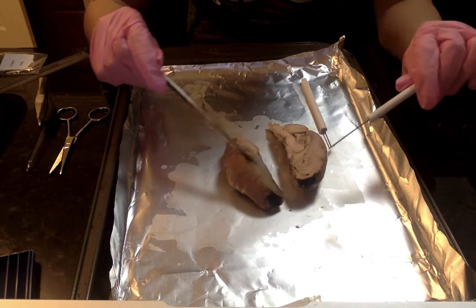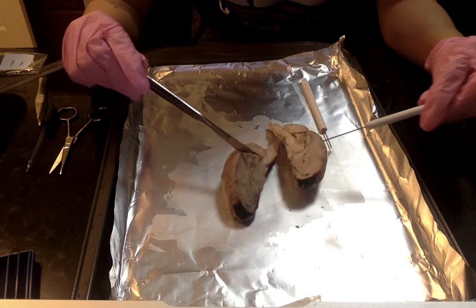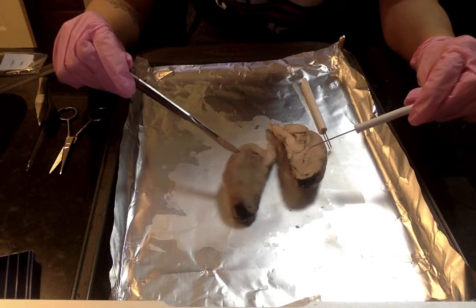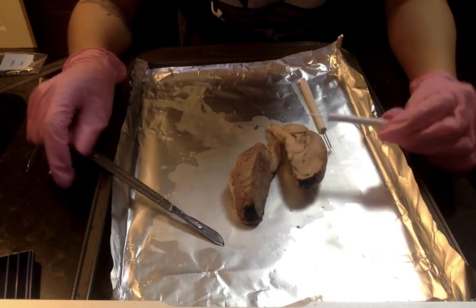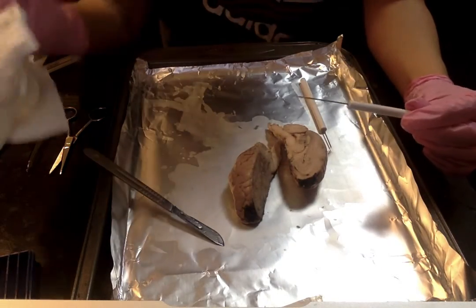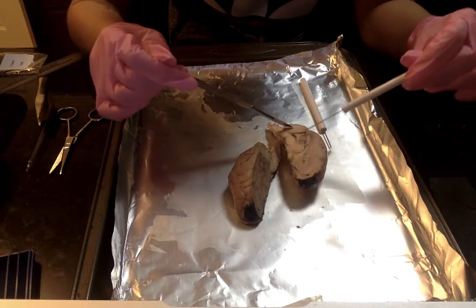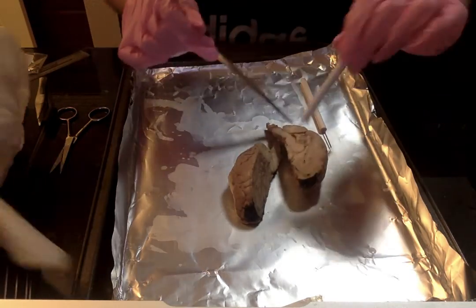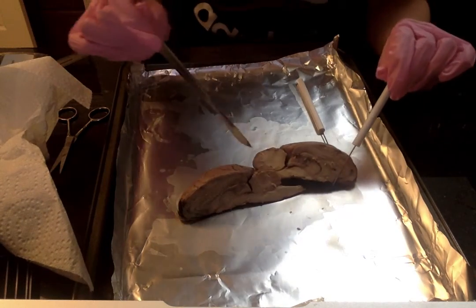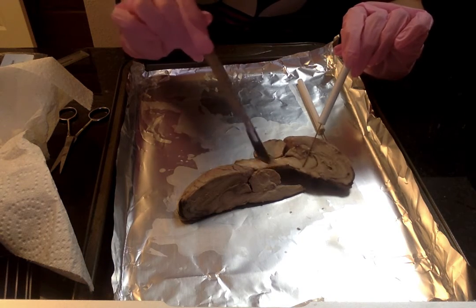So now I have a sagittal view of the brain, and I'm going to separate the two halves of the brain and lay them with the inside facing up, and this gives us a sagittal view. So we notice right here, I don't know if you can see what I'm pointing at. This is the arbor vitae right above the spinal cord right here.